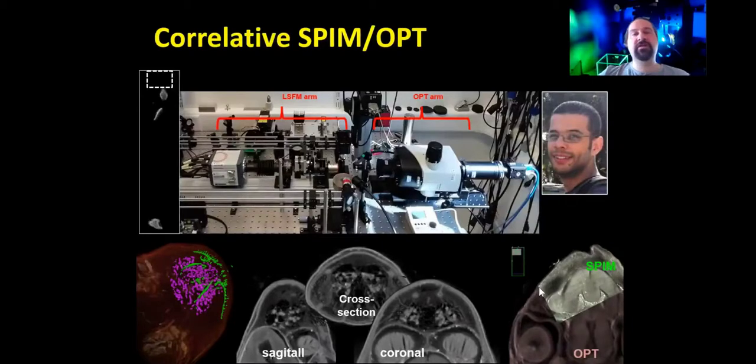The challenge then is to actually combine the two images and keep them in the same data set, so to speak, which you can still do using Fiji these days, and Big Data Viewer, for example, or other software solutions. So that's pretty much what we've been working on.